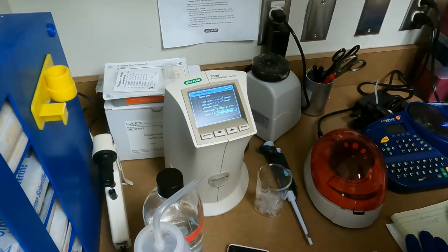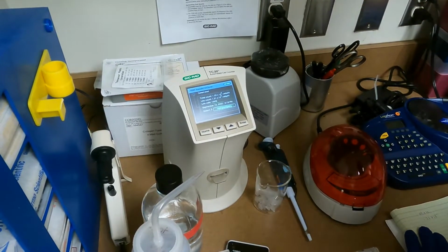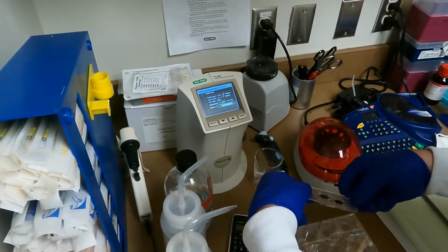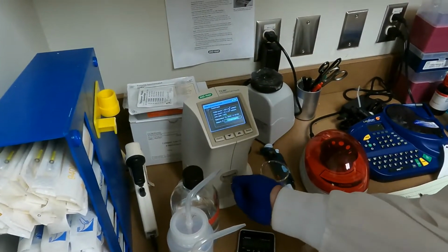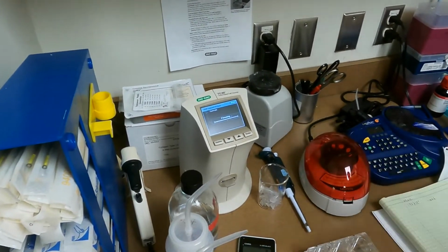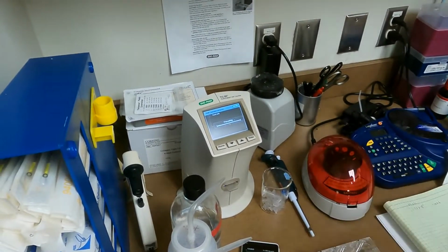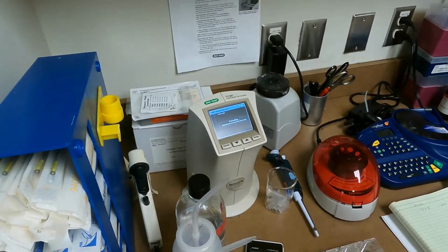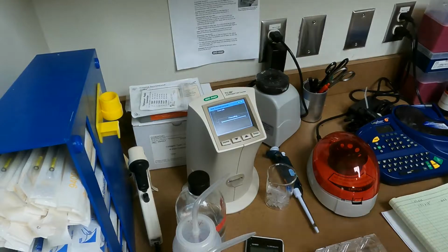And it's 100% viable, eh? That's good. I think it's because I filtered the trypan blue, actually. You always have to do that, put it through 0.2 microns. So we do it twice, just to see, because there's always going to be sampling error. And then we'll take the difference. We'll take the average. Okay.